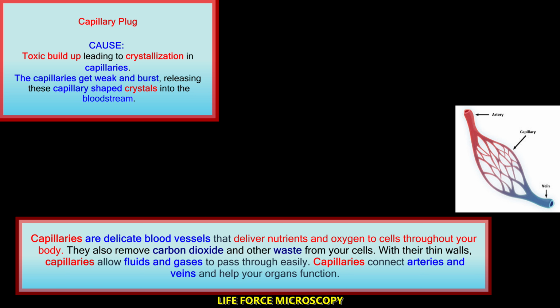So on a single page, every time you look at an image on a slide, whenever you see these things, it means that for some reason your body is accumulating waste products.